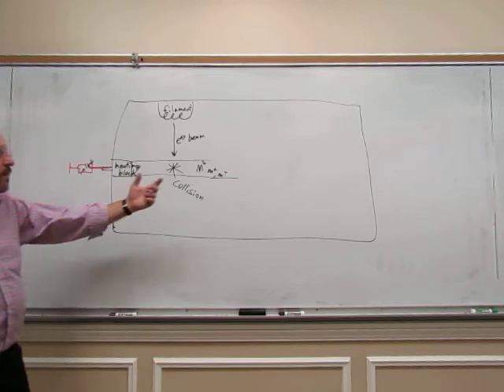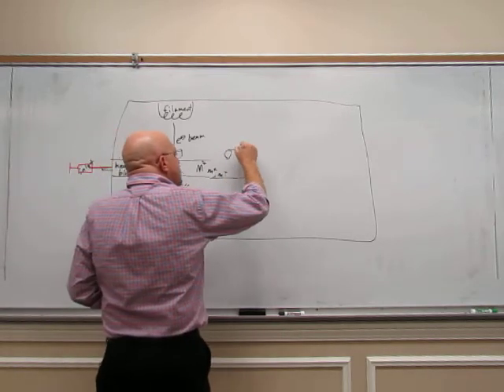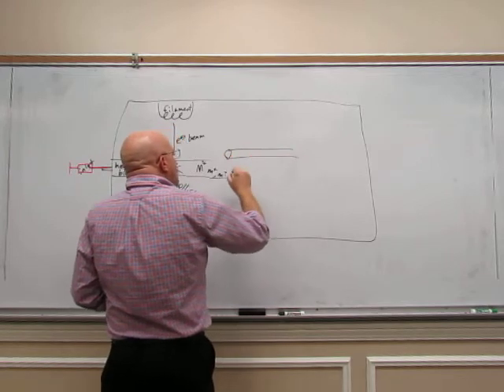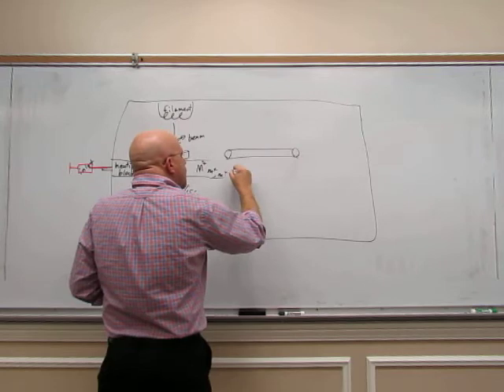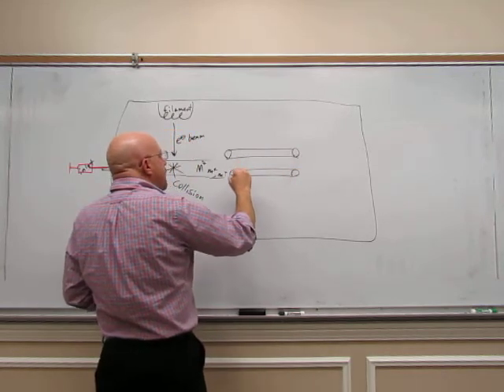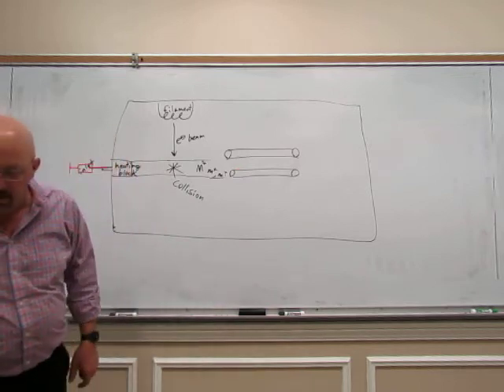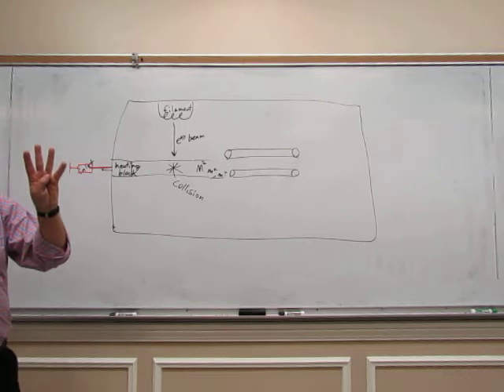Now, these aren't going to exist for very long. So to speed things up, we have a quadrupole. There's 4 poles. Kind of hard for me to draw this. I had pictures, but I'm going to draw 2 poles there. Trust me, there's 4. It's called a quadrupole.